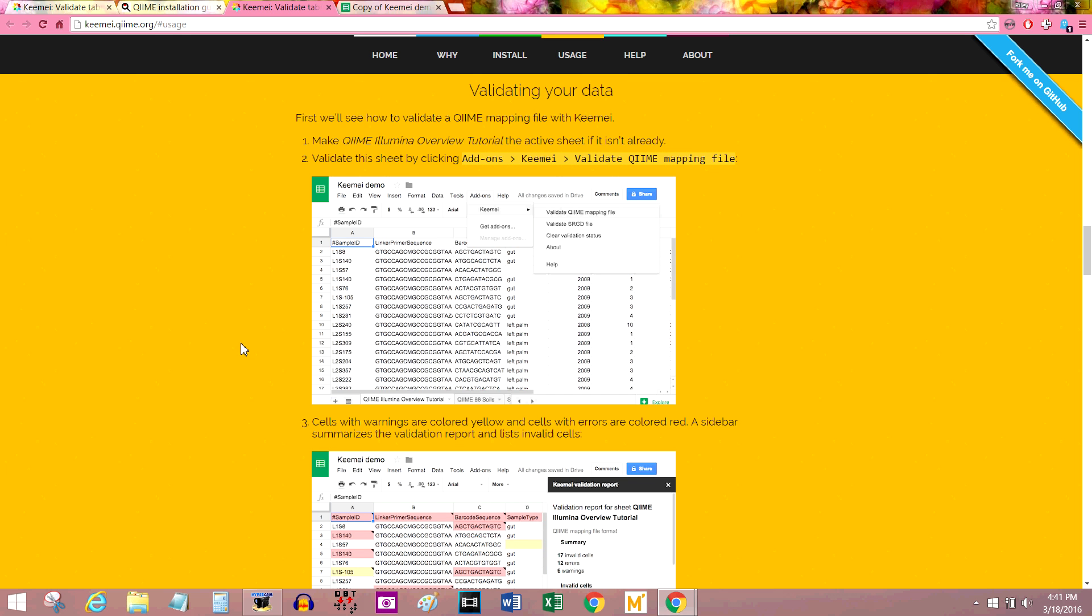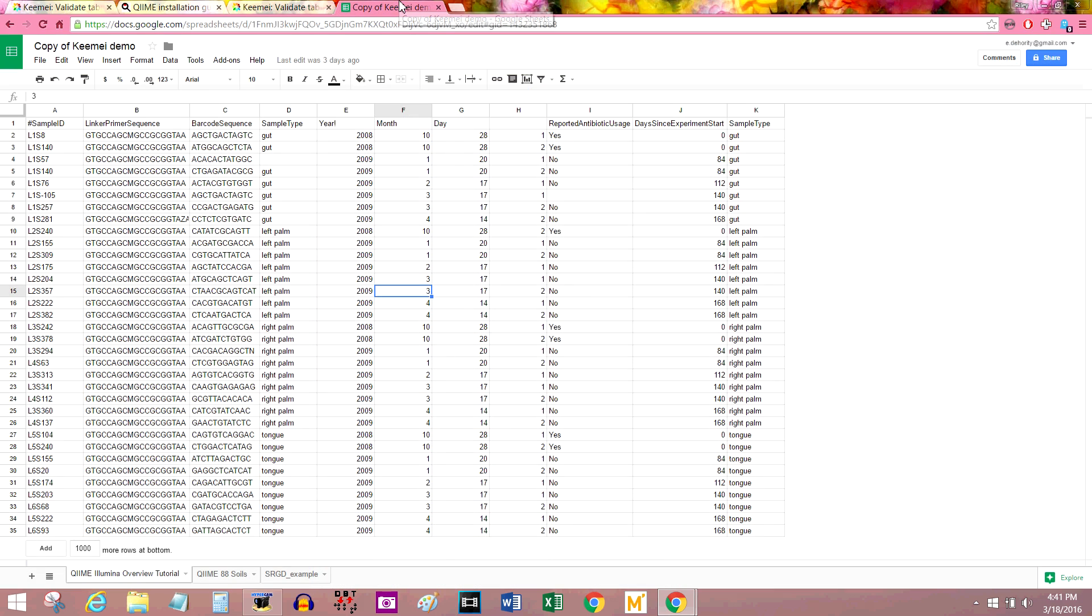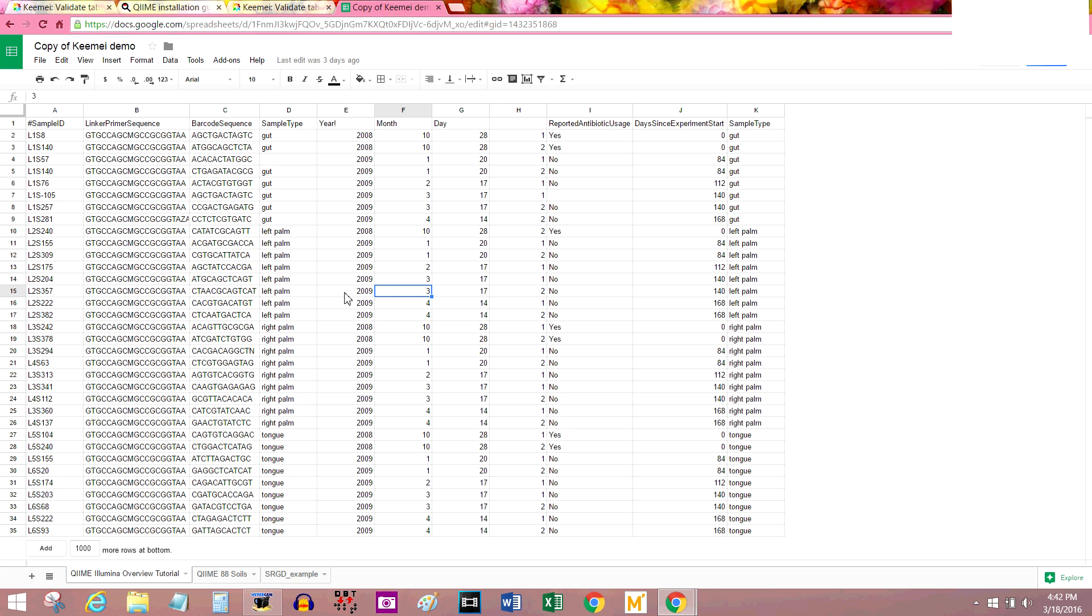So when I was first asked to make this video, it was because someone wanted to know how to validate and create a QIIME mapping file. Now they had been doing it by hand in Windows Notepad, but this makes it a little bit easier for you.